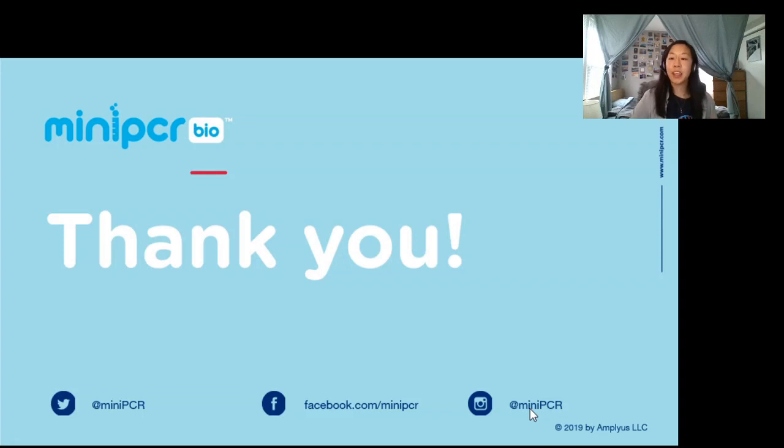All right, thank you so much for joining me. I had a blast being able to do an experiment in my bedroom. I've really missed being in lab. So I hope that was really helpful.